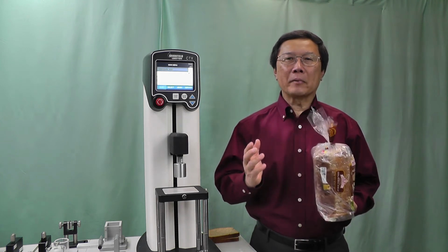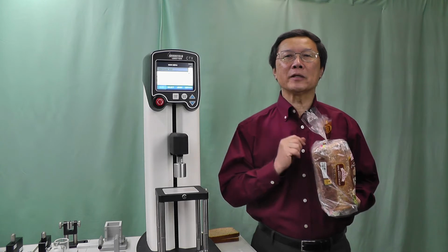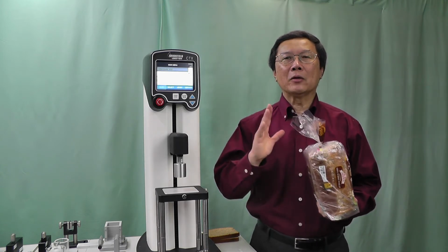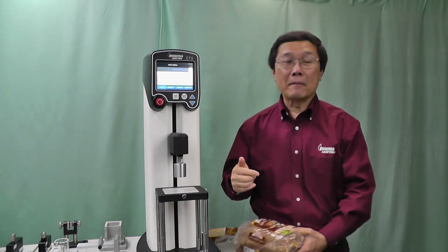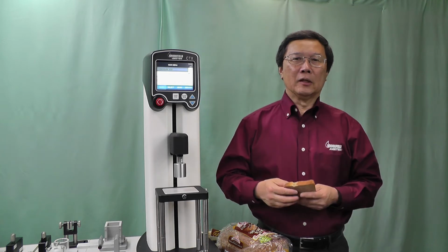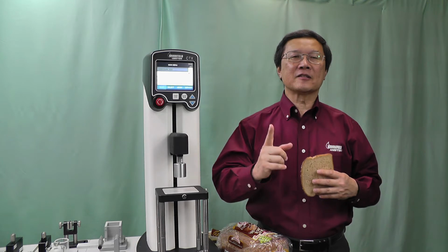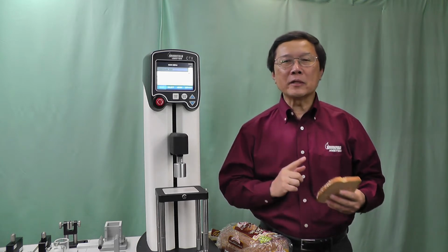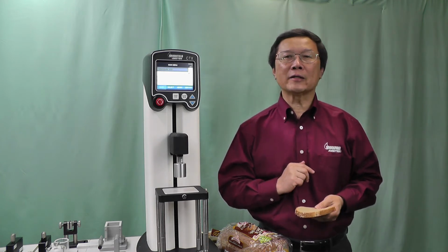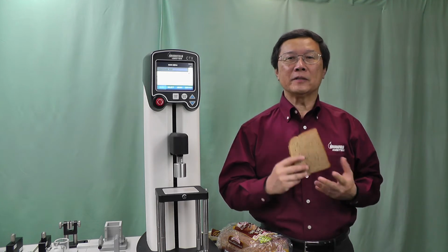The freshness of bread can be evaluated by the firmness and, to a certain extent, its springiness. The test is based on the theory that the peak load increases and compressibility decreases as the bread ages. To measure firmness, it is the compression test of the first cycle, while to measure springiness, it is a two-cycle compression test, also known as texture profile analysis, short for TPA test.